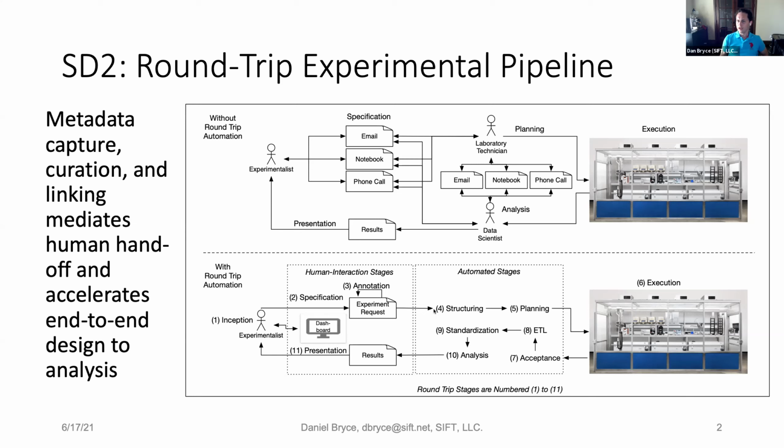And then even after they've attached a lot of that detail, there's still the matter of how do you implement this experiment on an automated laboratory. So we have planning technology that we've used to take the high-level description of what the experiment ought to generate and then figure out how to actually implement it using the robotic work cells and the automation available there. And once we've conducted an experiment, we have several different steps where we do acceptance checking on the experiments. Often what'll happen is laboratories will produce data that might not match what we were expecting. And so we've developed tools to help us identify those mismatches and address the problems as they arise.